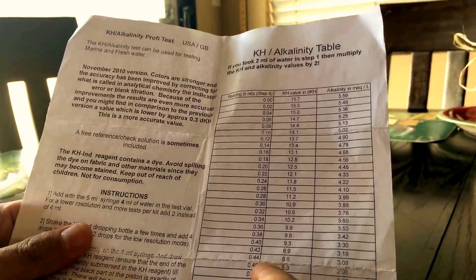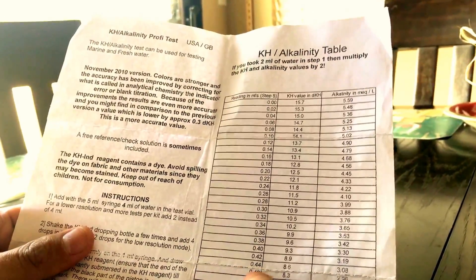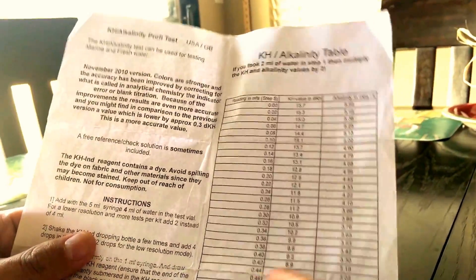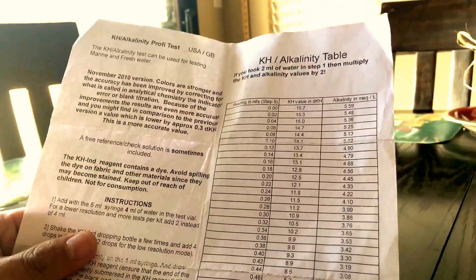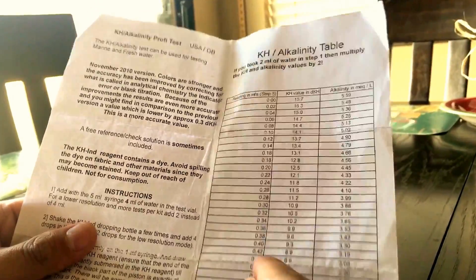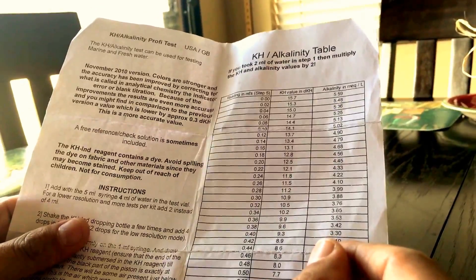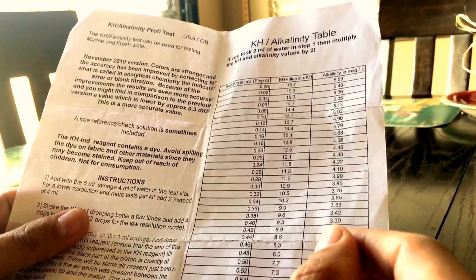There's no 0.45 exactly on the chart, but this is between 0.44 and 0.46, so my alkalinity is between those. I would say 8.4 dKH — that's my alkalinity right now in my tank, which has been very stable for four or five months at this level.